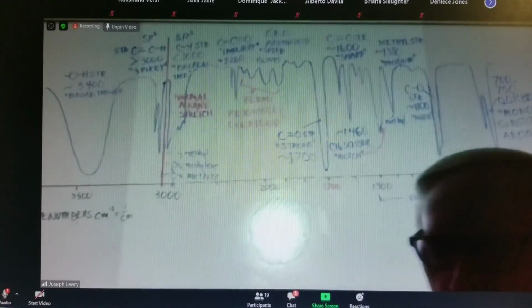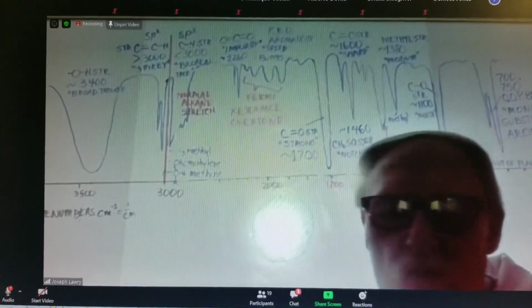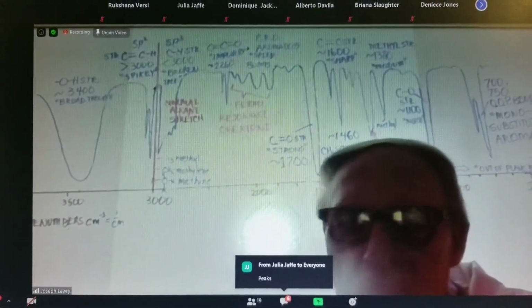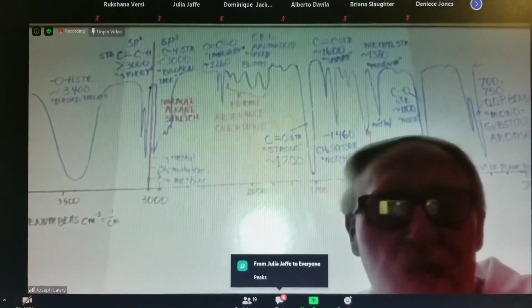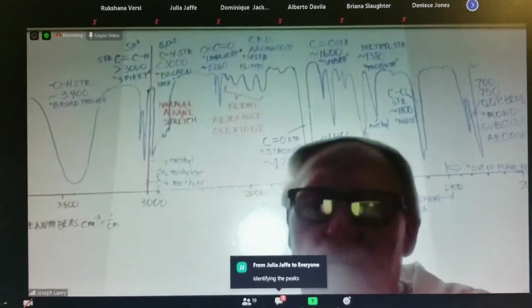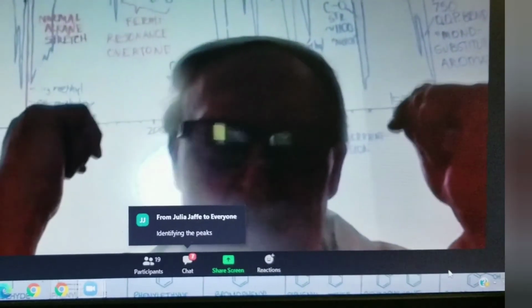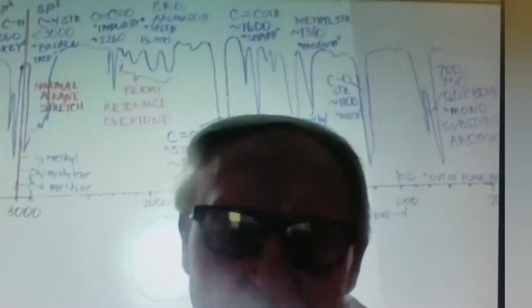Now, how do you use this? We're running out of time, so I'm just going to go to the use. How do you use this? Here's, you can learn these. And guys, on the exam, here's what you're going to have. You're going to have a real IR, one of my homemade drawings like this. You're going to get a real IR spectrograph.